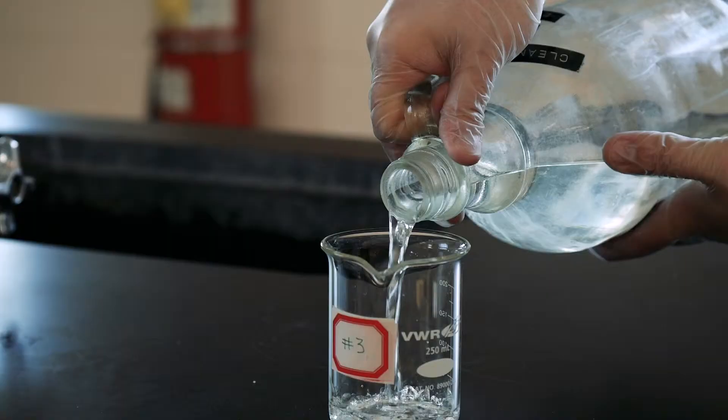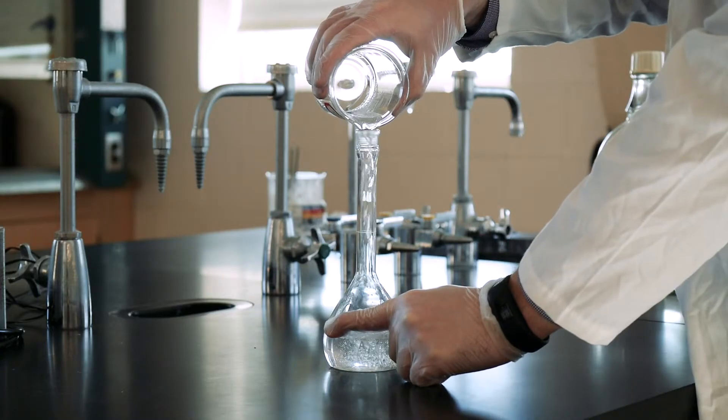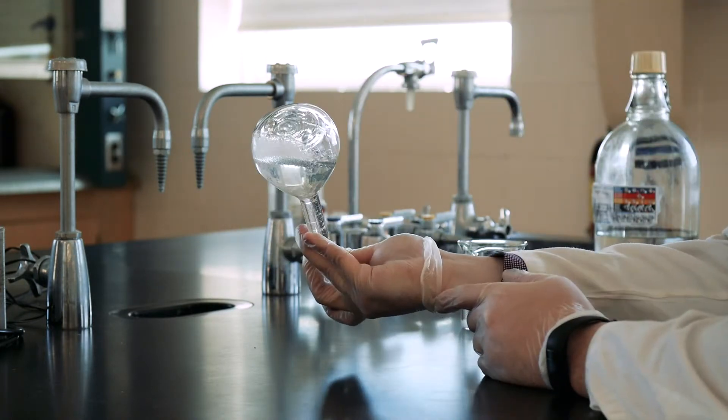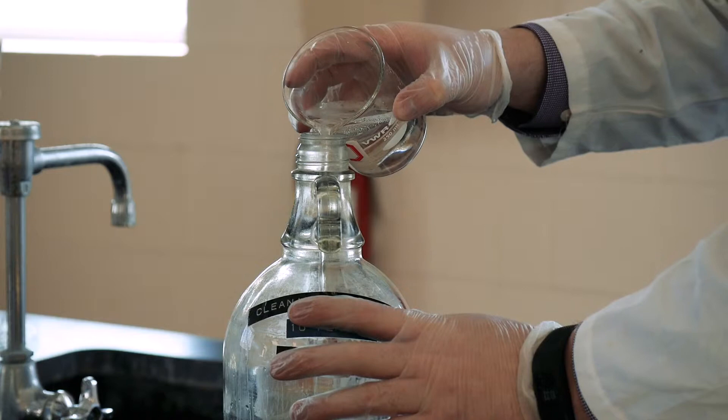Fill the volumetric flask to about half volume with X-Dram cleaning solution. Swirl gently, then invert the flask, and then pour the X-Dram back into the X-Dram bottle.